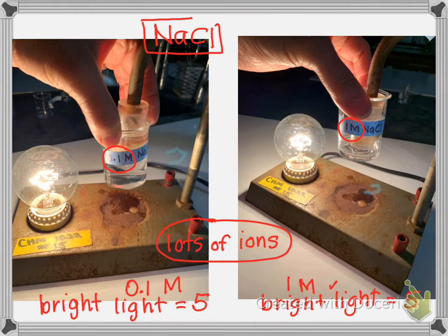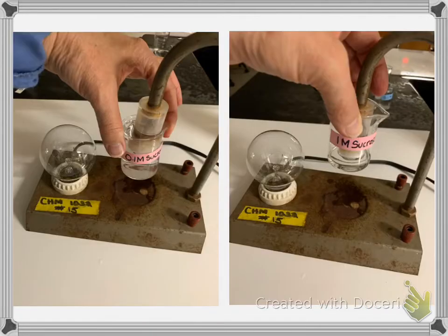I will tell you there is a limitation of my little light bulb, because light bulbs can only get so bright. If my light bulb could get brighter, the 1 molar one on the right maybe could get brighter, but my light bulb can only get so bright. But sodium chloride, which is an ionic compound, has lots of ions when it's in solution, and so this is a strong electrolyte.